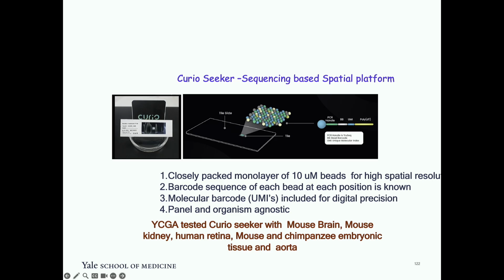Mostly we just got the FFPE protocol, but earlier it was just fresh frozen sections, OCT embedded sections. You put the sections over that area. So this is a lawn of oligos, and this consists of this set of barcodes and a bead. Now you put your sections over that and put your finger at the bottom of the slide. The idea is that we have a body temperature of about 37 degrees centigrade, so we just allow that section to melt over that region.